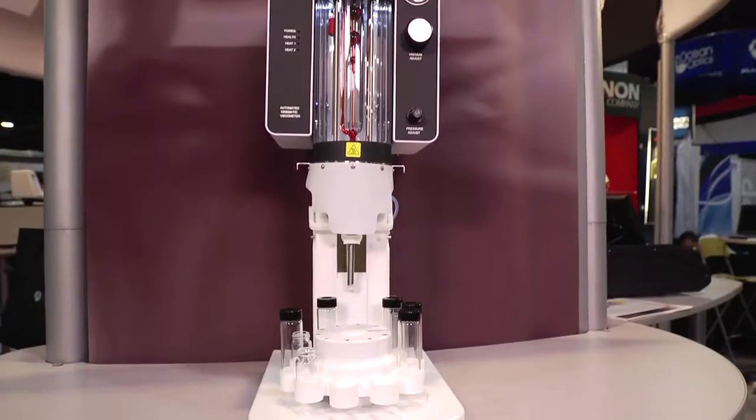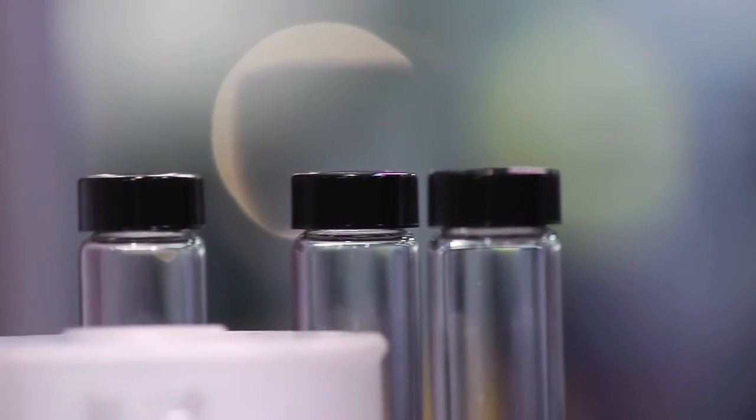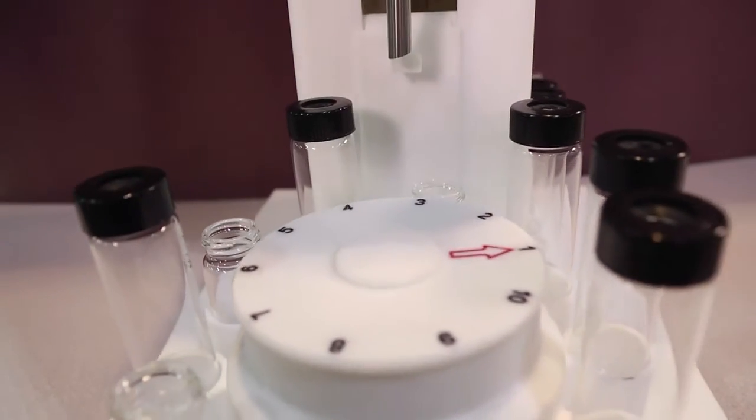It has a 10 position sample tray which will allow you to test unattended, and it will accommodate any ISO and ASTM polymer methods.